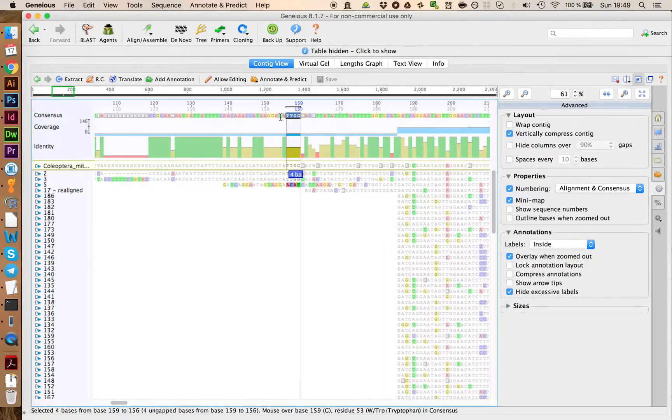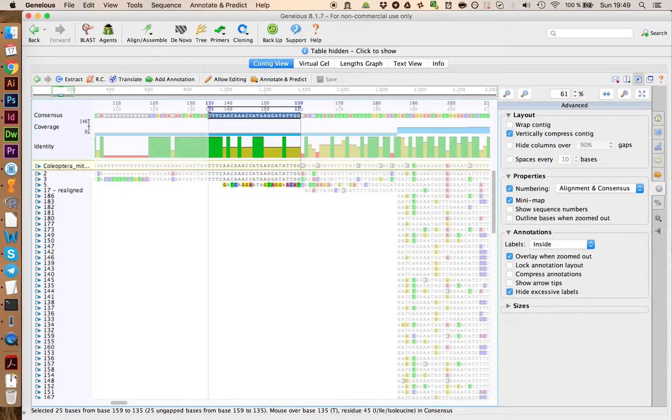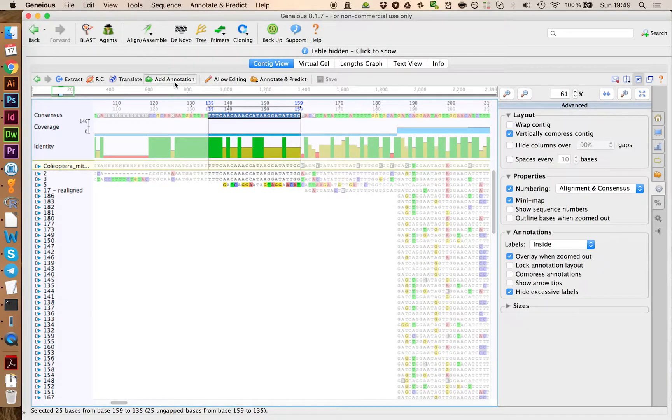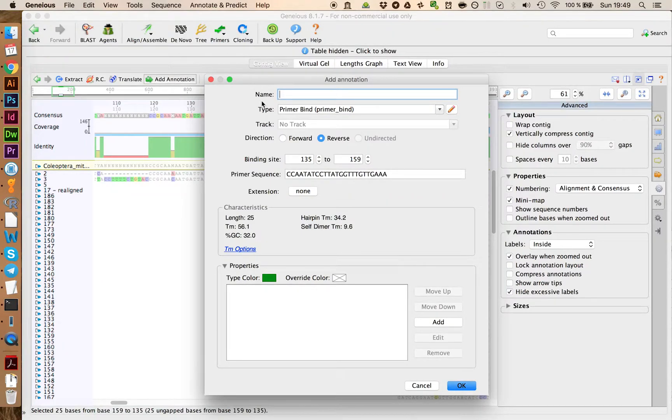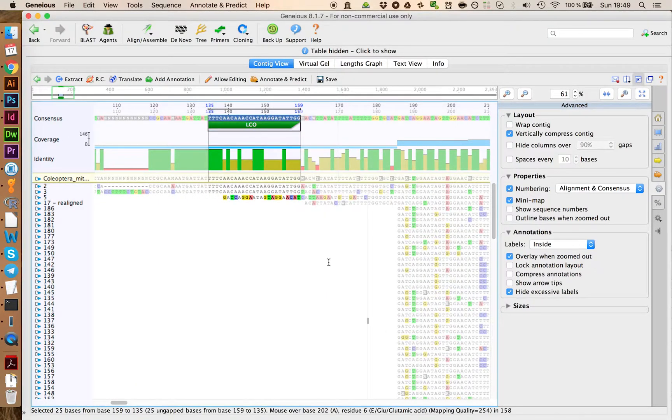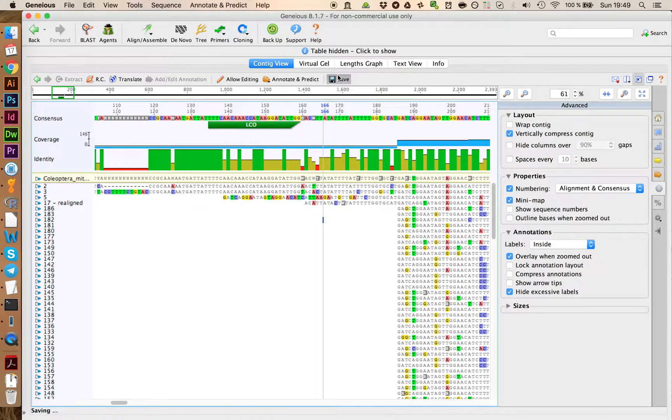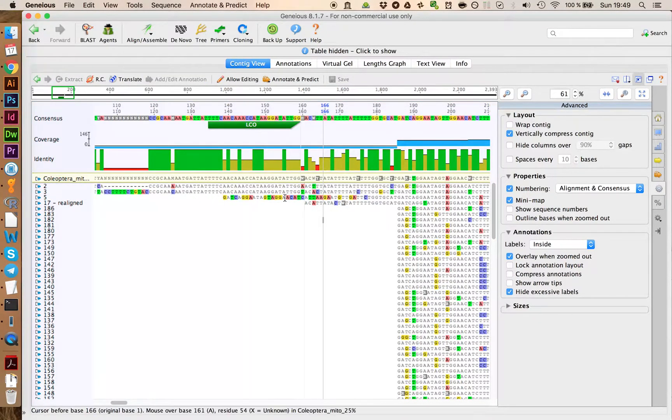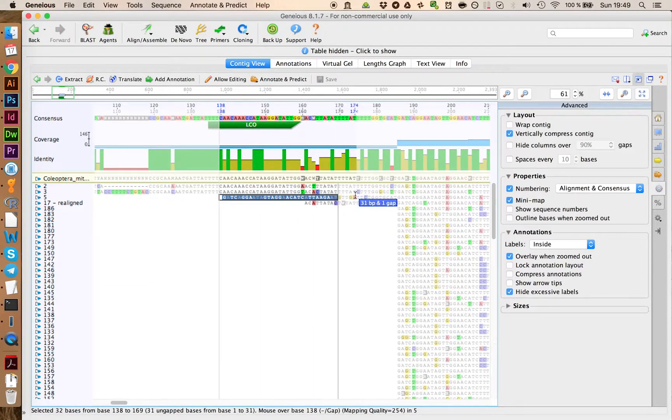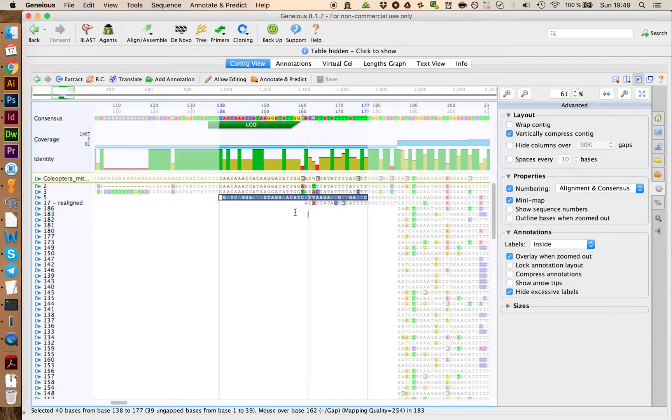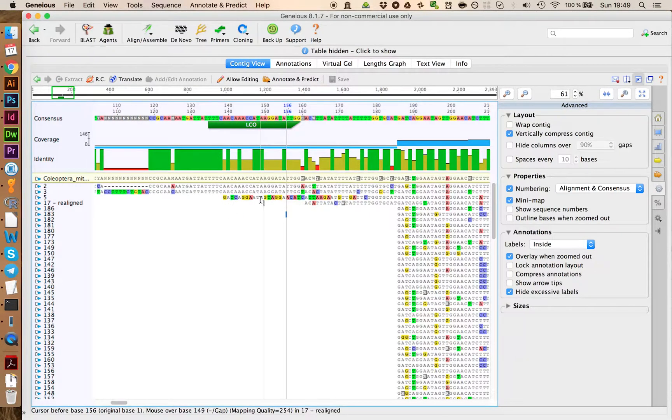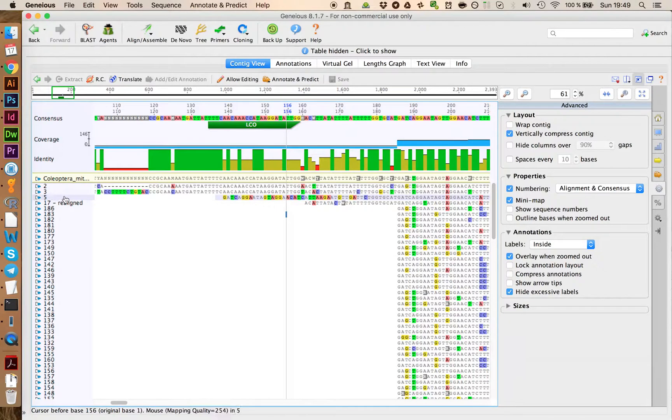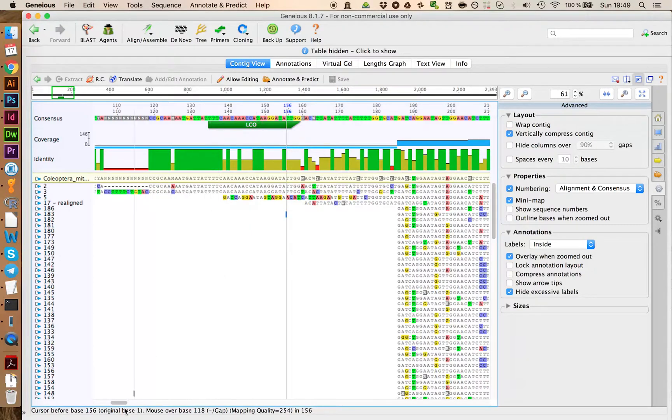So let's add an annotation for the LCO primer. This one is 25 base pairs long. We go and add annotation and write down LCO and we switch this to forward as well. Like this. We see here that we still might have some problems on some sequences. Usually you might want to fix this. In this example, I'm not going to go to sequence 5 and repair this one. For demonstration, I think this is just fine.